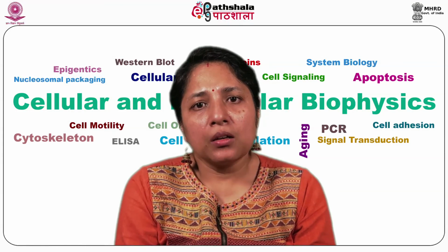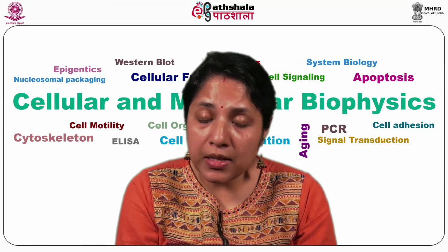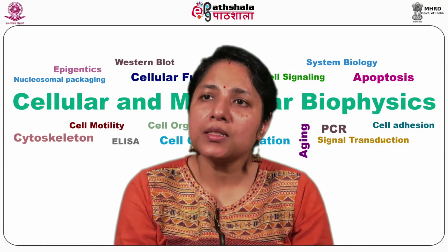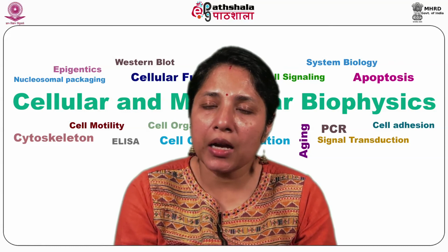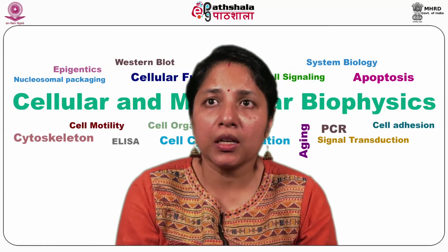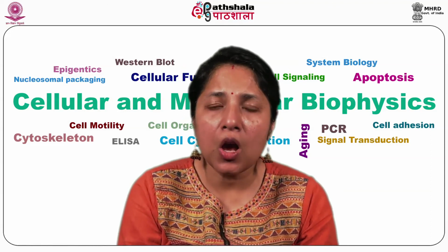And last but not least, as I said, the technology is advancing, and we are using microfluidics to understand cell motility. In this, various factors can be studied at a single time point, and it is a very rapid and sophisticated method, and cells can be analyzed both at the single cell level or in a group of cells.